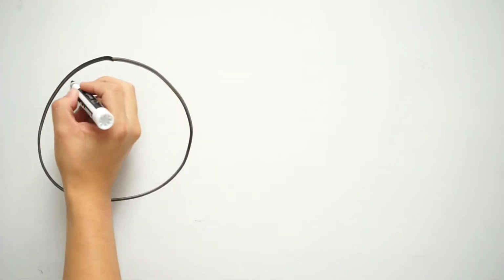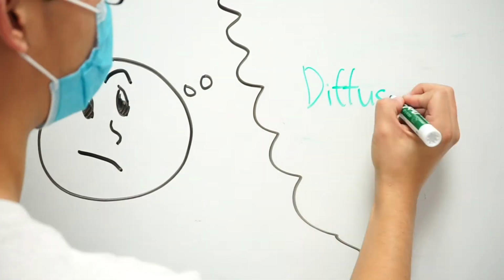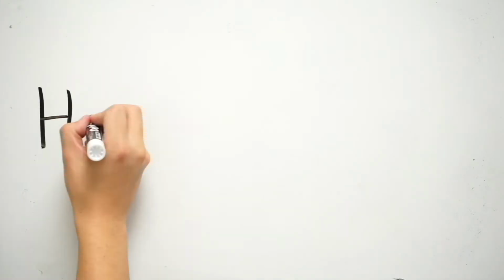Naming originality aside, this model allows us to determine the effects that diffusivity and linear flow rate have on theoretical plate height, which has a massive influence on the resolution of the peaks in the mass spec. The smaller the H, the better the resolution. Simple, right? Yes and no.